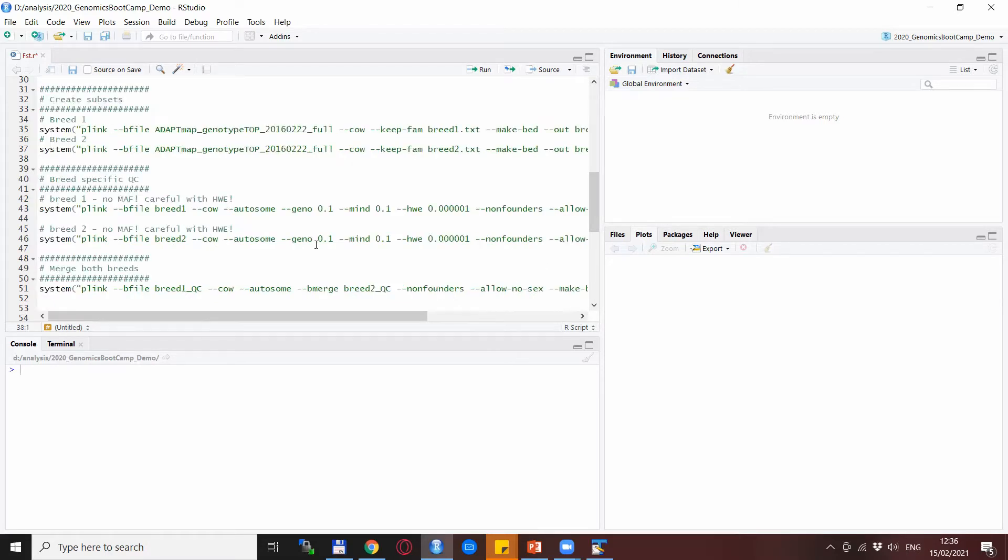The next step is merging, so we need to merge the two files together.